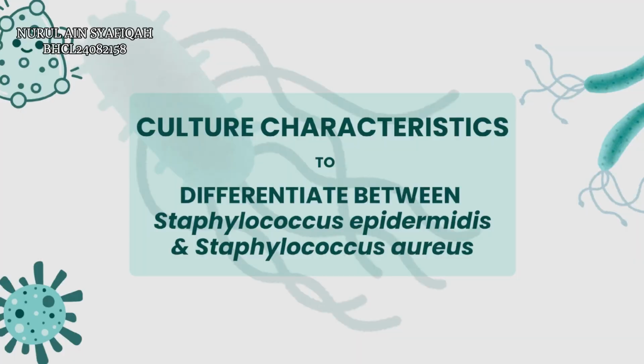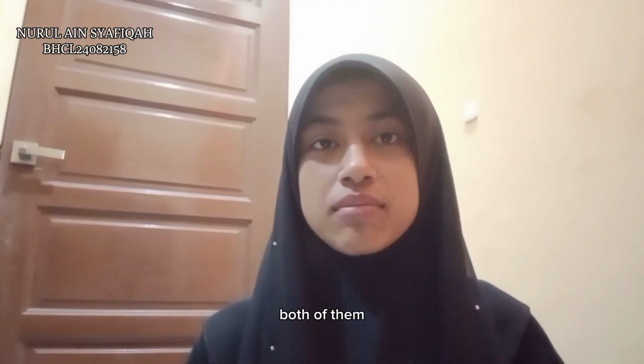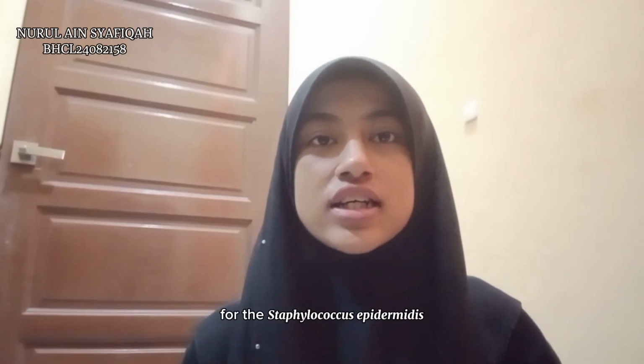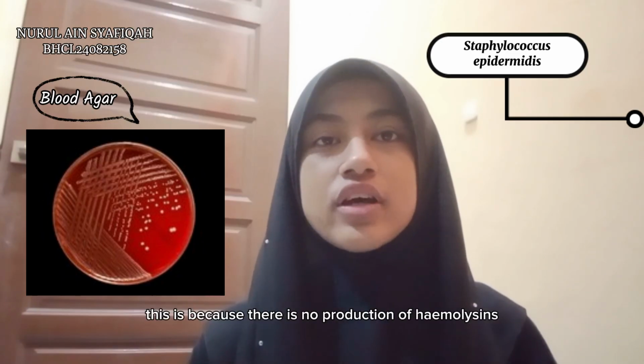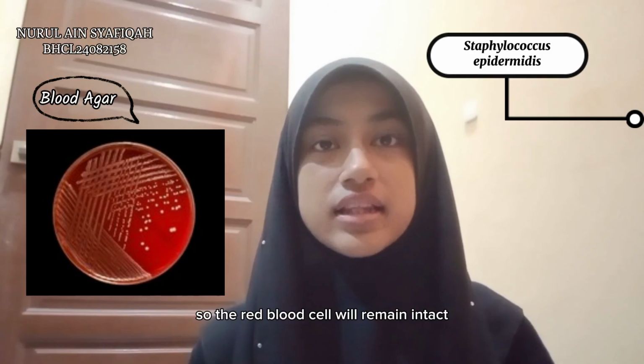For culture characteristics in differentiating between Staphylococcus epidermidis and Staphylococcus aureus, we can use two different culture media, which are blood agar and mannitol salt agar. For Staphylococcus epidermidis, the blood agar will show gamma hemolysis, which is non-hemolytic. This is because there is no production of hemolysins, so the red blood cells will remain intact.